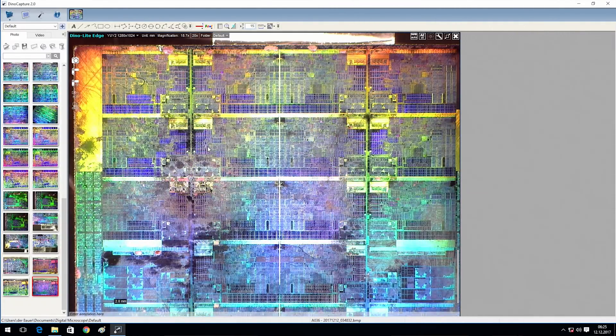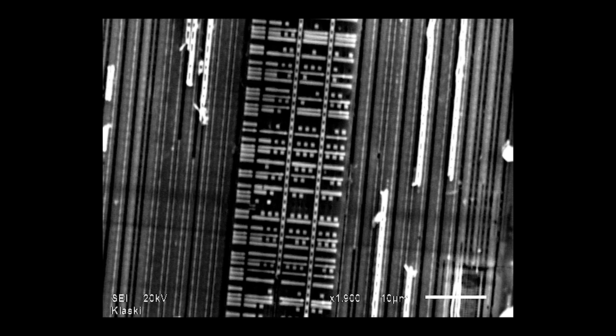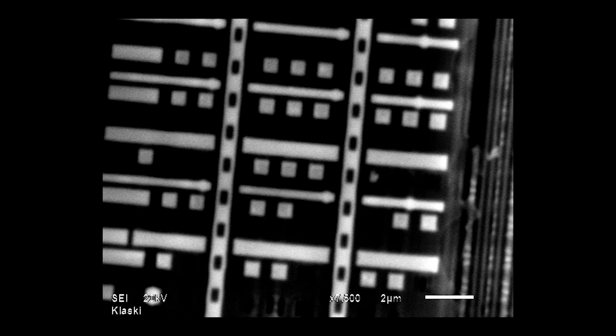To show you even more how tiny those things are, I took the die from my i9 7980XE die shot video and put it under the scanning electron microscope. On the bottom you can see a tiny hole inside the die in one of the metal layers — that's where we zoom in. At 30 times magnified you can see the small hole; at 650 times you can already see some very tiny structures that look like traces connecting layers. At 1900 times you can see some rectangles and cube-like shapes. At 7500 times it's even more detailed, and finally at 14,000 times you can see perfect squares in the structure with remarkable clarity.